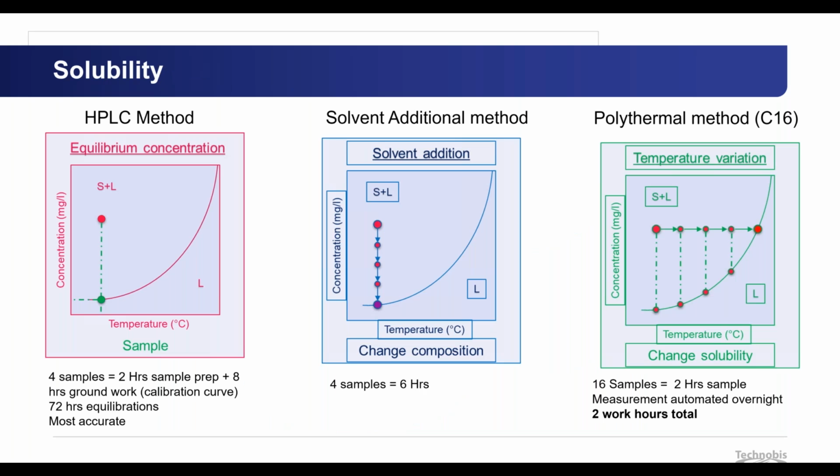Going back to solubility, there are different methods out there on the market. Just briefly looking at one of the most common ones, the solubility determination by equilibrium, or the HPLC method, which is quite accurate. But if any of you have determined solubility by HPLC, and I'm pretty sure many of you have, you know that it takes quite some time, and the determination is of a concentration at a certain temperature.